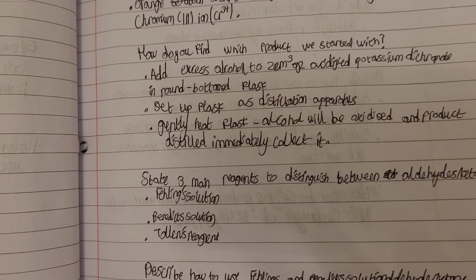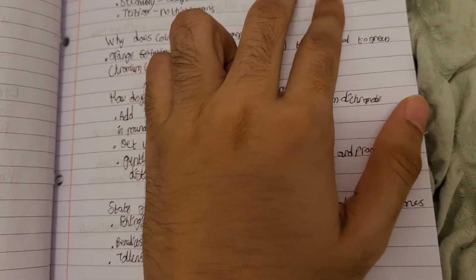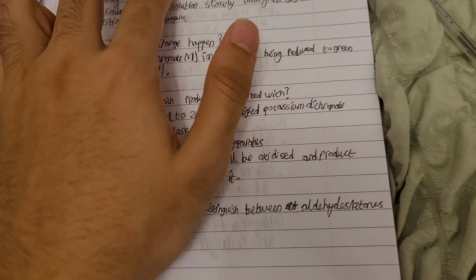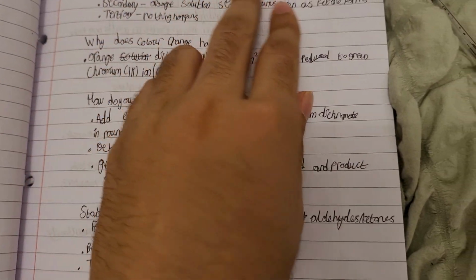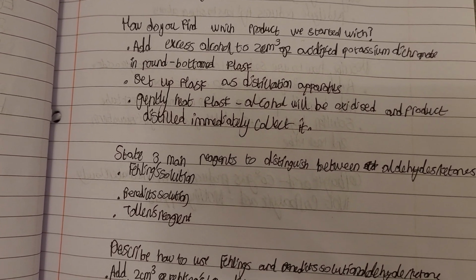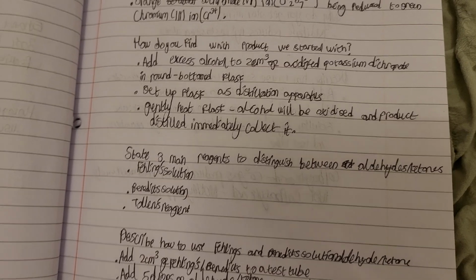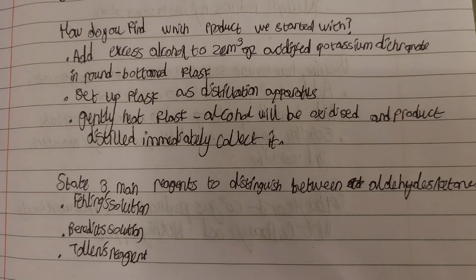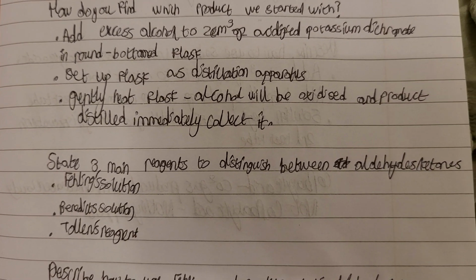So how do you find out which product we started with? Because for both primary and secondary alcohols, the orange solution slowly turns green. If we want to find out which product we started with, add excess alcohol to 2 centimeters cubed of acidified potassium dichromate in a round bottomed flask.